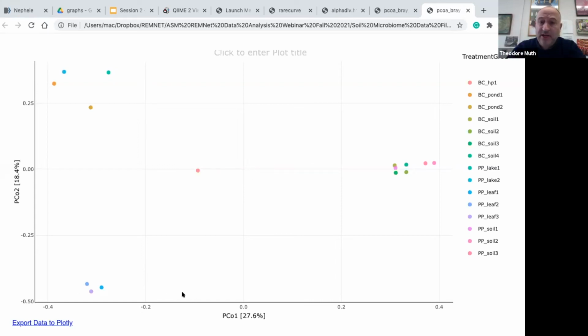The leaf litter samples were actually taken right above those Prospect Park soil samples. So they're literally just one layer above those soil samples, but the communities are different enough to really visualize that on a plot like this. So if you're able to collect enough samples, some from soil, some from water, or some from one type of insect and some from another type of insect, you might expect to see those clusters form among those samples.